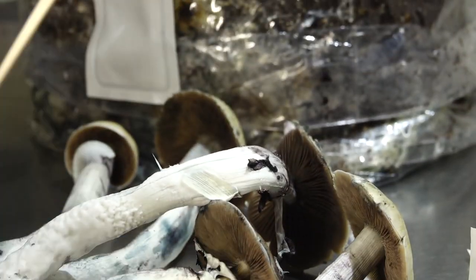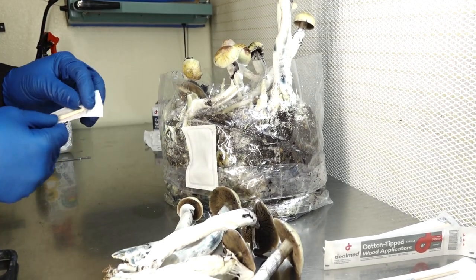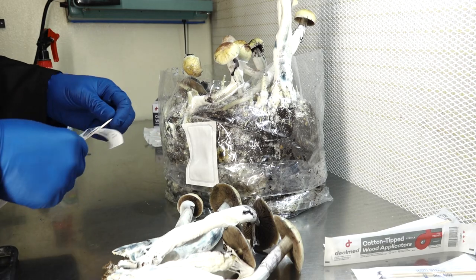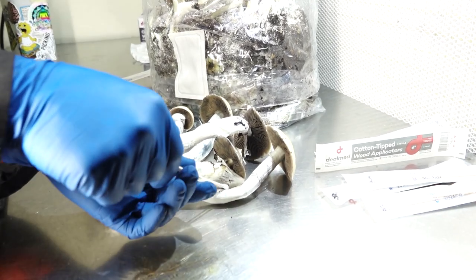If you're doing this at home, you want to make sure that all of your surfaces have been pre-cleaned. As I did before we started shooting, everything has been wiped down and triple-cleaned to ensure cleanliness, and our hands have also been sanitized. Like I said, we are working in front of the flow hood to ensure the cleanest specimens.